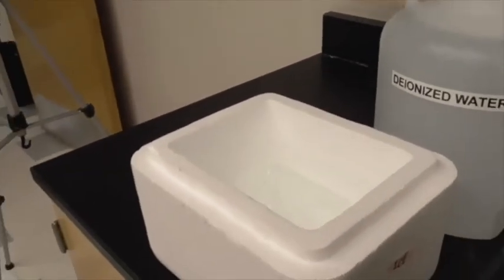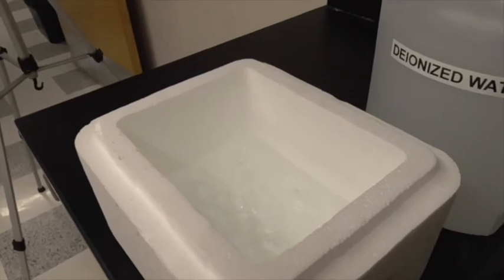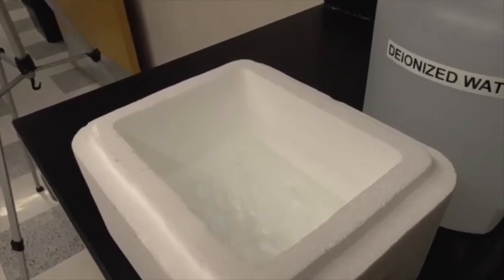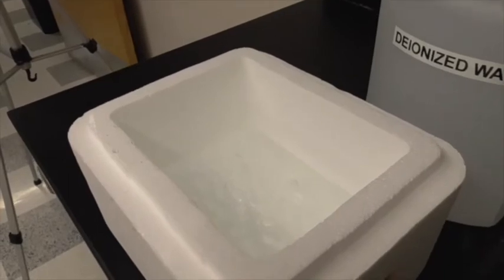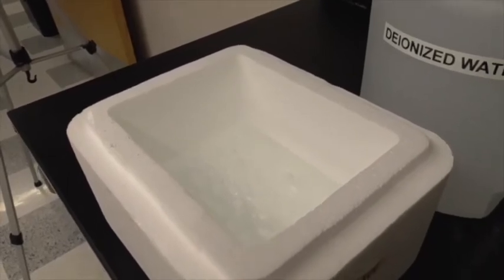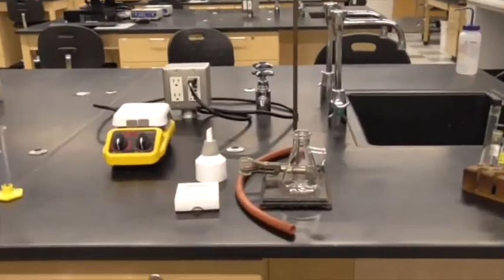Behind us here, after we get crystals, we're going to put the beaker in an ice bath. It's got some ice and some water in it, and that's simply going to cool down everything and produce as many crystals as we possibly can of aspirin. We have our filtering apparatus right there.